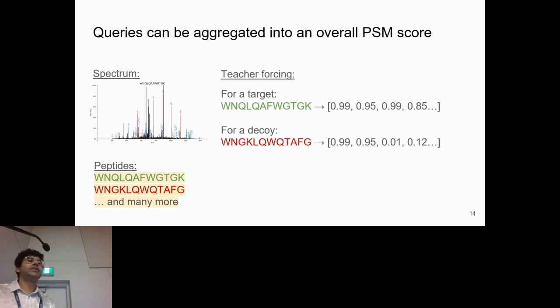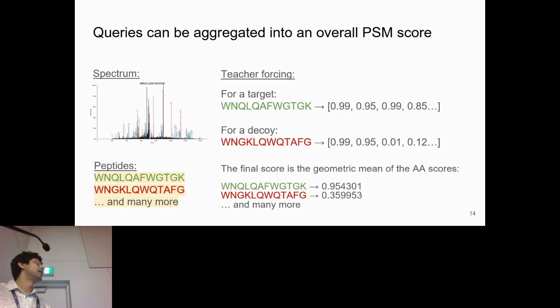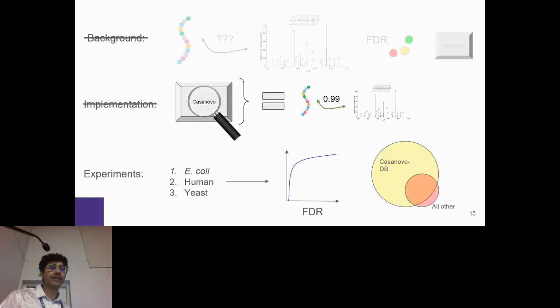What we can do with this now is just take these lists, these aggregates of these scores, and just take the geometric mean of them. And what that gives us is exactly database search results. So we have for each peptide spectrum pair a score that goes along with it. And that score, we can just take the highest scoring peptide and say this is the generating peptide for this spectrum. Wonderful. So now we've taken a de novo tool and applied it to a database search setting, and it works great, which would be the next section of the talk.